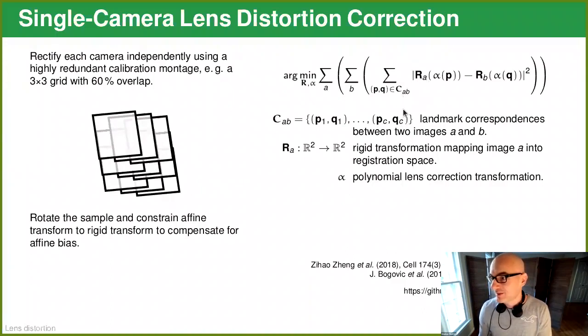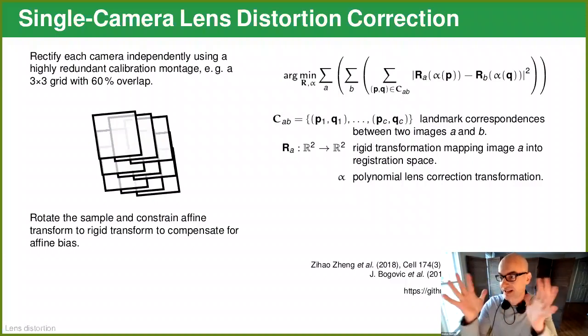you should do this when you can, but you can use the same approach to calibrate images from multiple camera systems. And in the EM example, we actually did this because Davi Bock's camera system consisted of 4 cameras per each microscope, and he also had two microscopes of this kind, and then another one that was experimental, and all these cameras had slightly different distortions. And we want an average camera of all of these things. So how can you do this?